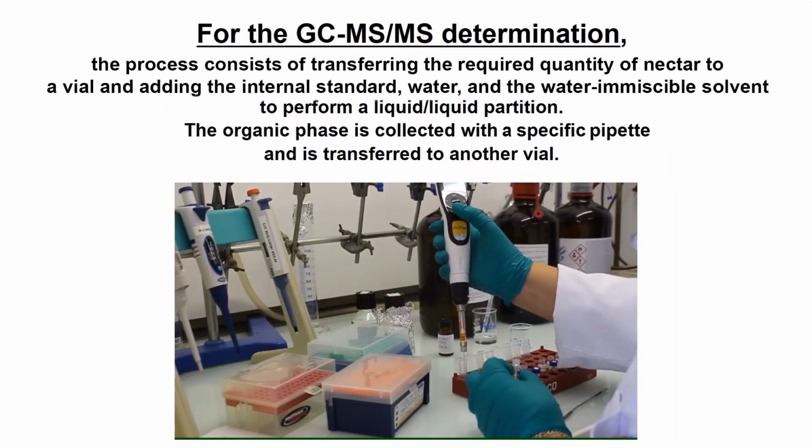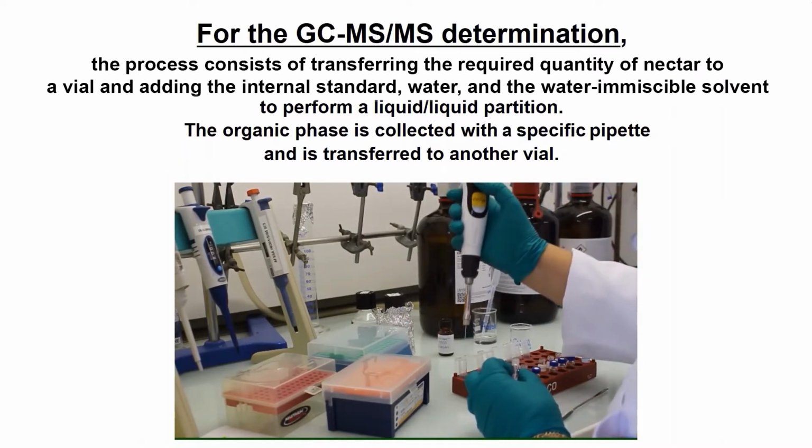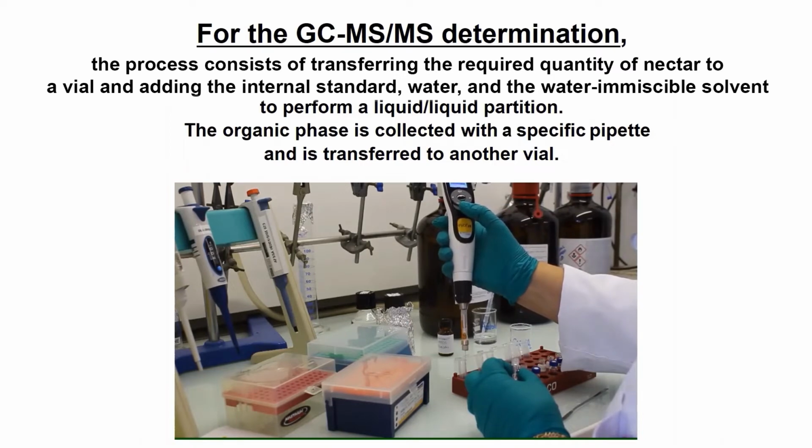The organic phase is collected with a specific pipette and is transferred to another vial.